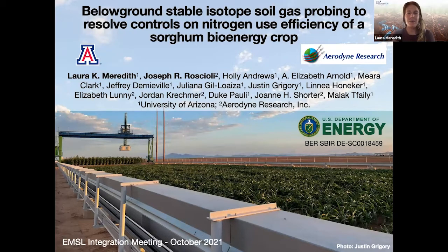Today I'm going to talk about our common desire to sense microbial activity in the soil and in the rhizosphere. We would like this to be real time, in situ, non-disruptive, and also at relevant scales to the processes we're studying. And so here I'll present a flexible approach, developed along with collaborators at Aerodyne Research, using volatile compounds and their isotopes as indicators of biological interactions and nutrient transformations.